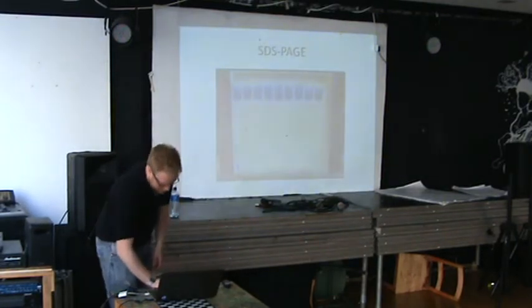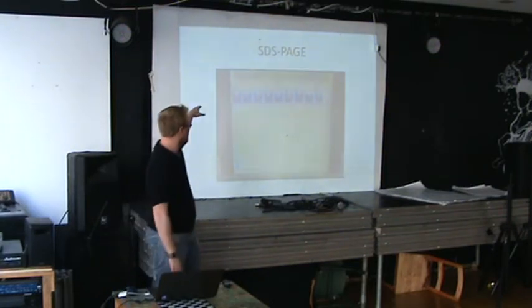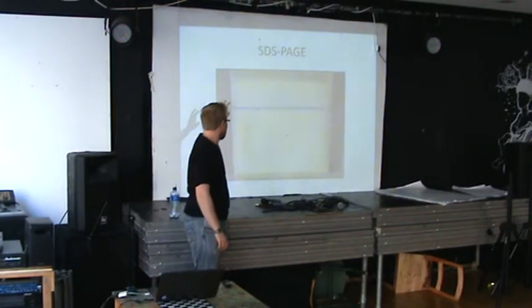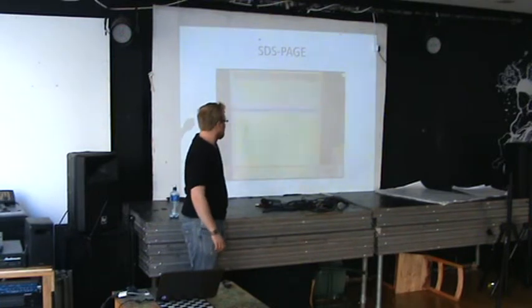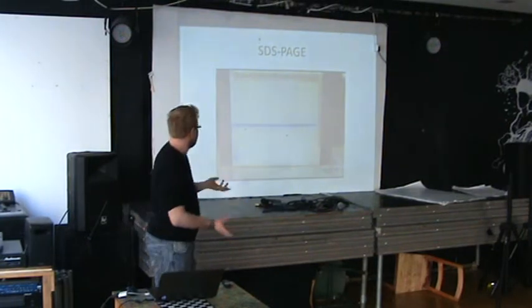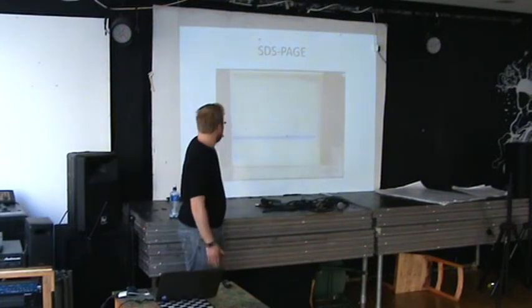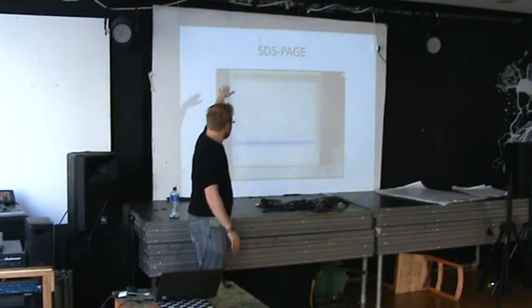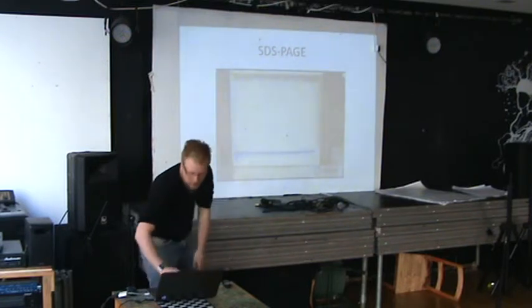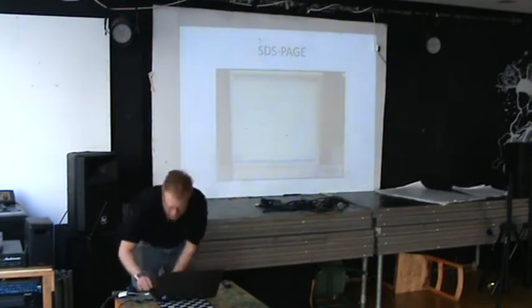So I'm just going to show you exactly what it looks like when you're running the gel. Now this is over about an hour. So you put your proteins in with your loading dye. That's showing you that it's blue. They're moving through. The dye is going to move faster than the proteins because it's just a dye, so it's going to go through to the bottom. That will show you when to stop applying the current. Your proteins, you can't see them because they're not colored, but they're just sorting out based on size.